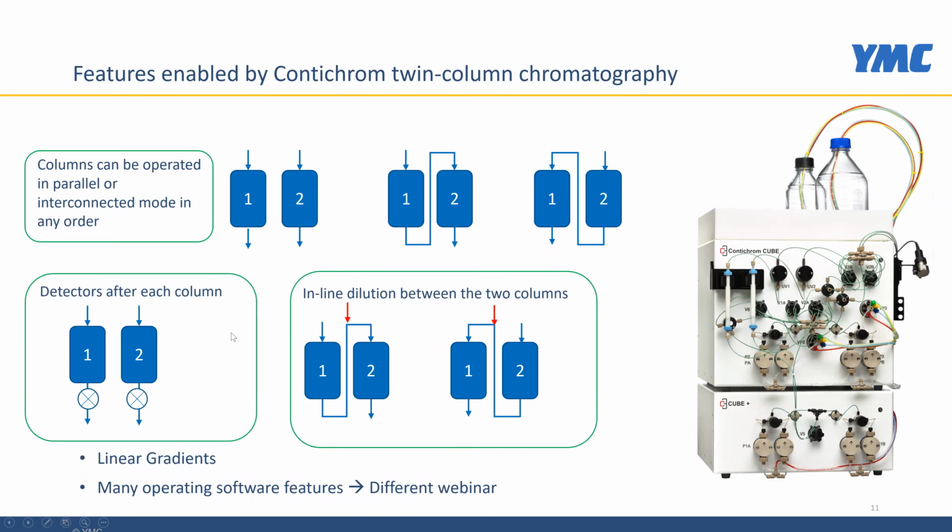So these modules are standalone programs, and they can be carried out while the ChromIQ is running. So you can write methods while the system is running, or you can evaluate data while the Contichrom system is running.